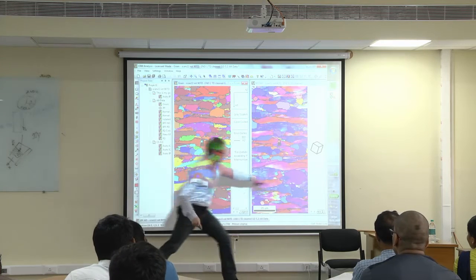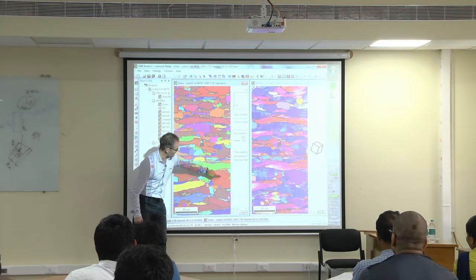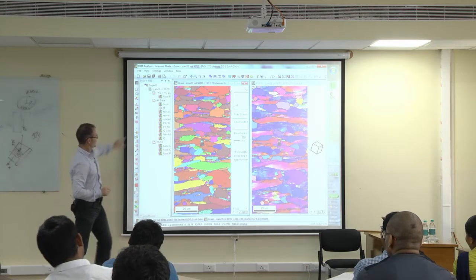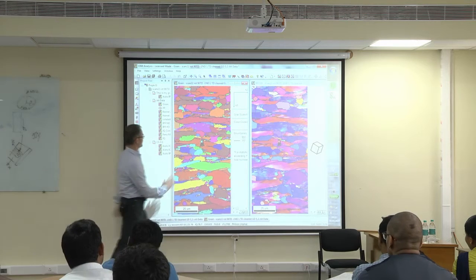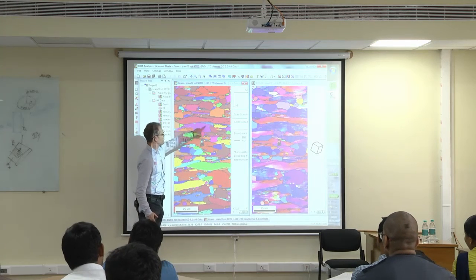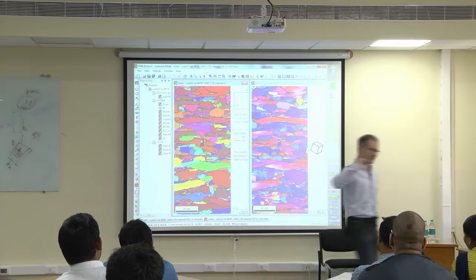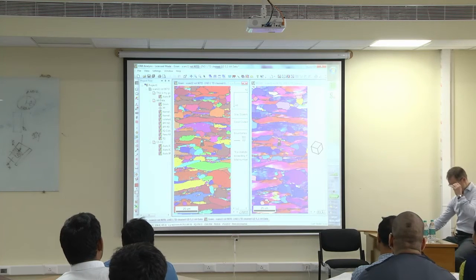And we had this other case here, this one here. Has it been separated? Yes, it has been. This is 1 grain, this is 1 grain. So the 2 degrees was obviously quite effective. Still, this one is still 1 grain. I think this 2 degrees is good, except that we now get a lot of stupid spread little grains in there. Okay, that I don't want. I don't want grains which are too small to be grains.